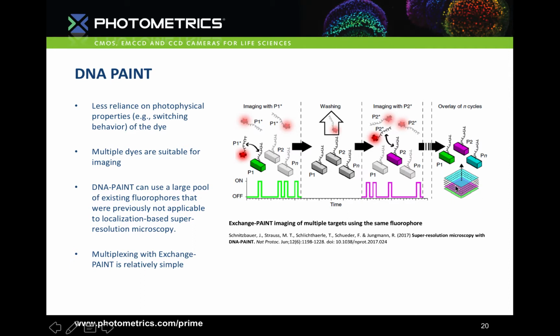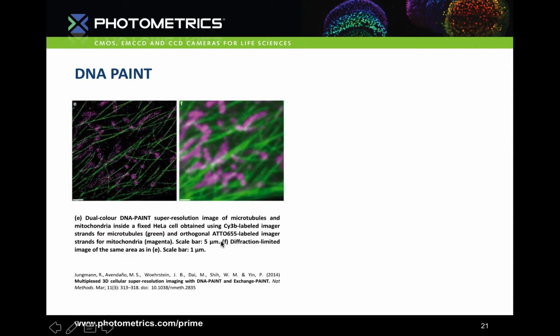The image here shows that DNA-PAINT can produce super-resolution images on par with PALM and STORM in multiple colours. But it isn't without its own drawbacks.